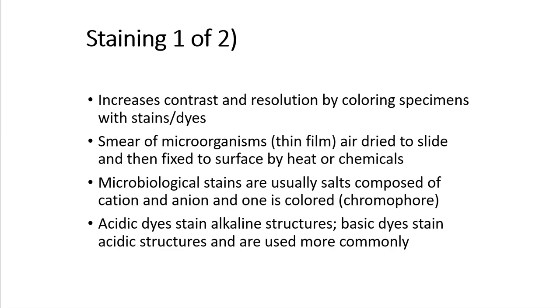You'll see it in a little video I have. You pass it very gently, quickly through heat, through a flame in a Bunsen burner, or apply heat, and that adheres that bacteria to the surface of the slide and allows us to work with it. Then we go in with a stain.